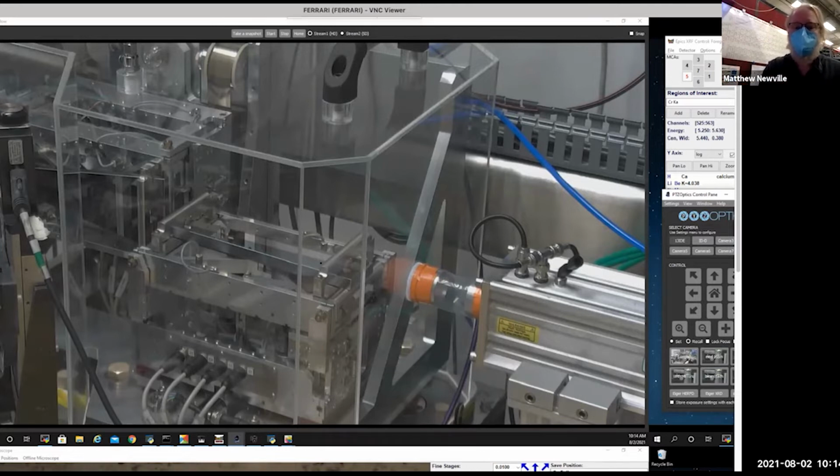So we're making this into an ellipse that has one focal point being 50 meters upstream, the x-ray source, the undulator source, and the other focal point being where our sample is, which is just 300 millimeters downstream. So it's a very asymmetric ellipse, but it's an ellipse. Actually, it's also bent to about a curvature of a kilometer or so. That's the size of the APS. So it's not bent very much to make that ellipse, but it's bent enough. We actually do that dynamically. I can show you that later.